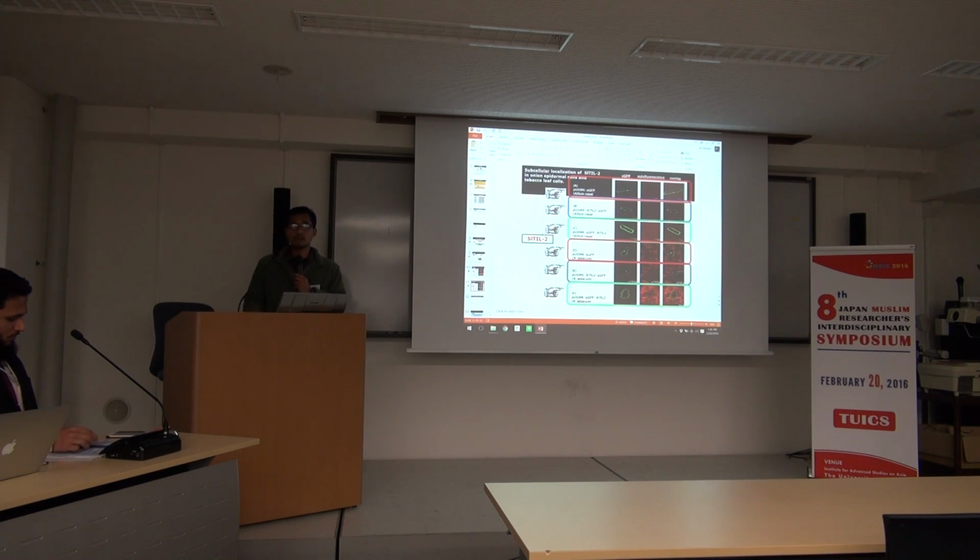We also checked with bioinformatic tools, like ChloroP and TargetP for chloroplast targeting, and the result was the same. So our data from the software and from particle bombardment give the same result.